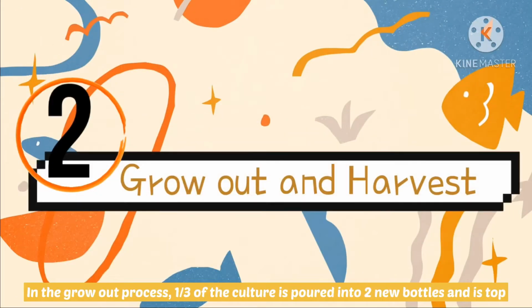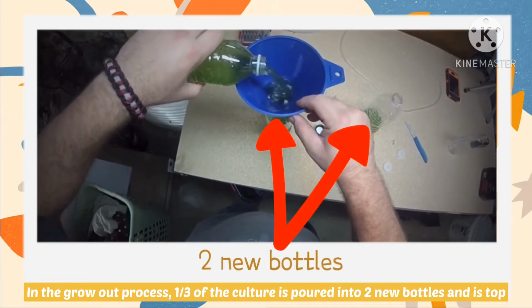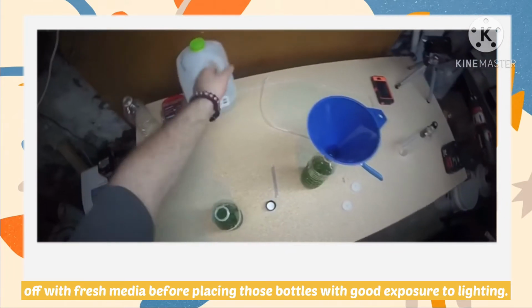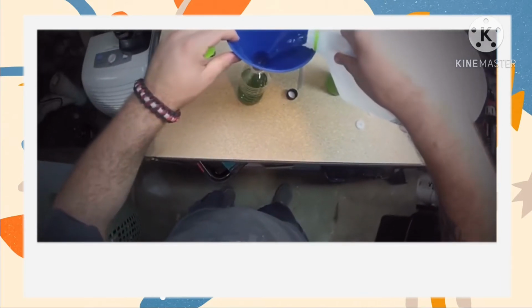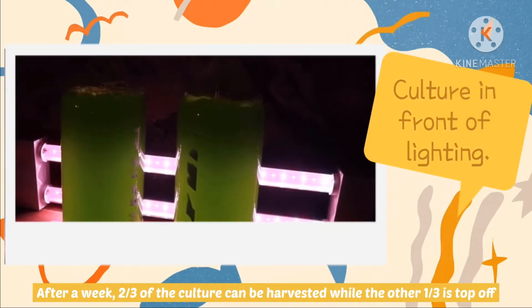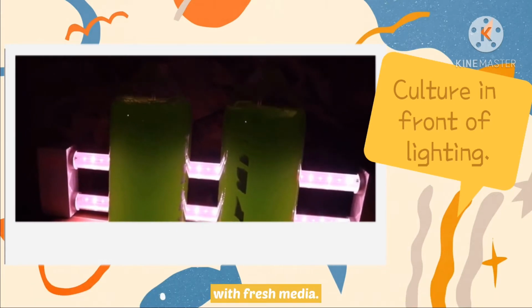In the grow-out process, 1/3 of the culture is poured into 2 new bottles and is topped off with fresh media before placing those bottles with good exposure to lighting. After a week, 2/3 of the culture can be harvested while the other 1/3 is topped off with fresh media.